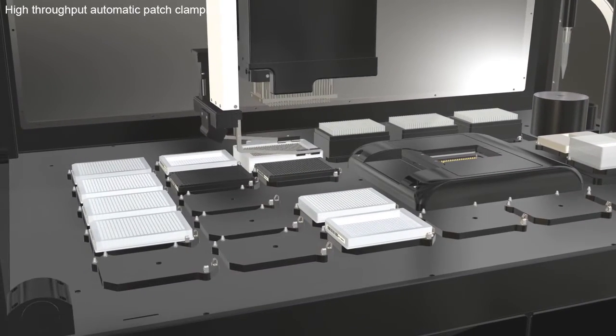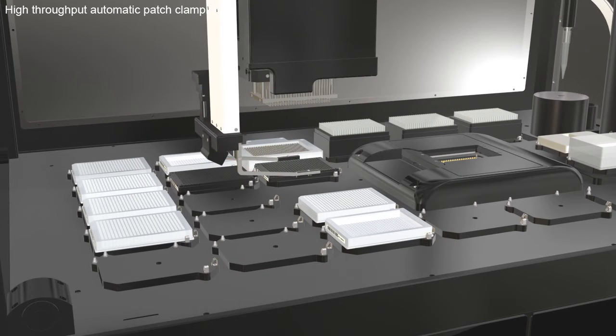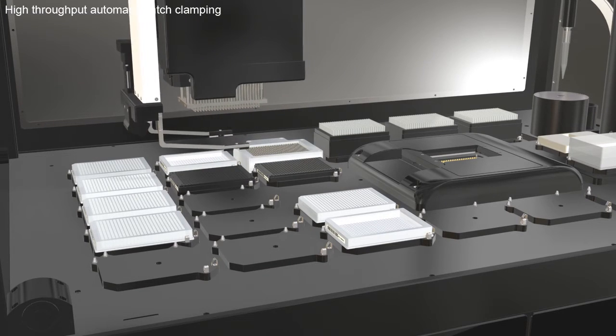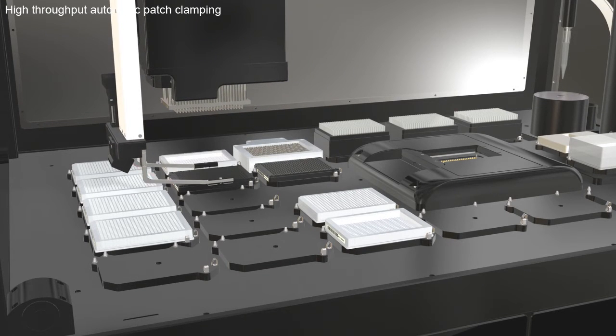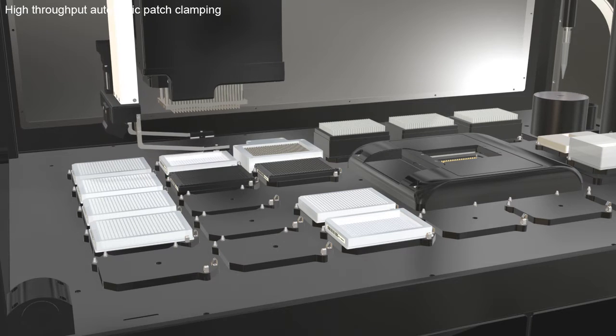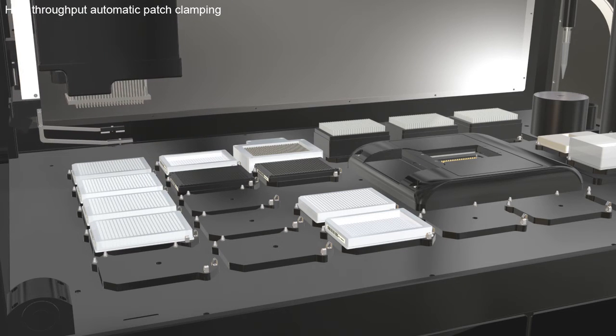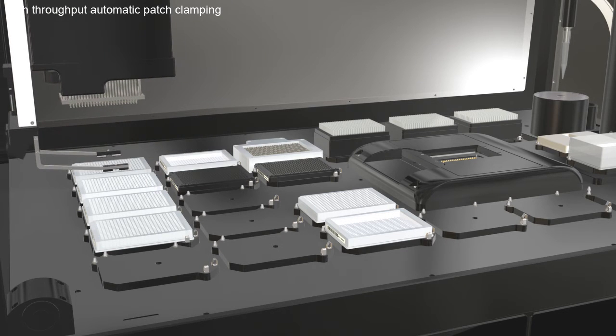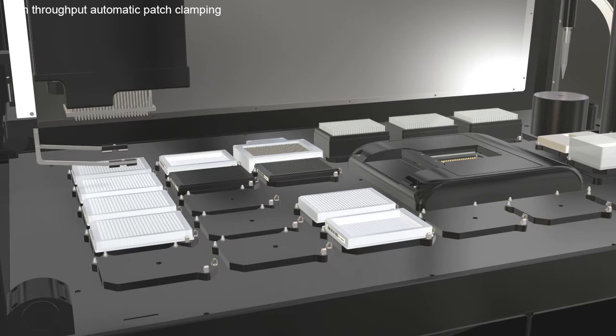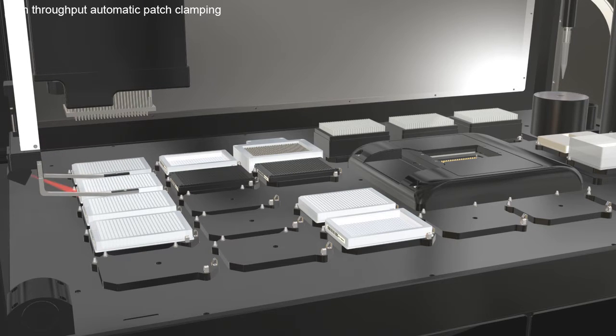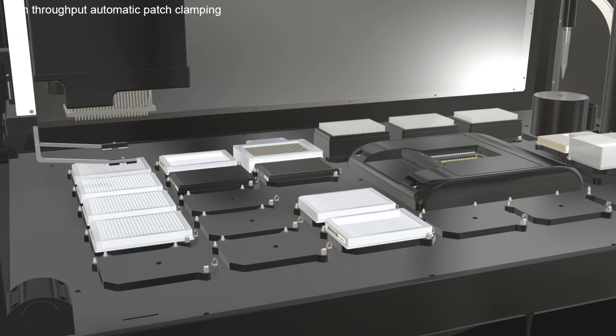Meanwhile, the barcode scanner mounted on the 384 pipetter reads the barcode from the Q-Chips and compound plates. This barcode information is used to track contents and locations of plates and compounds.